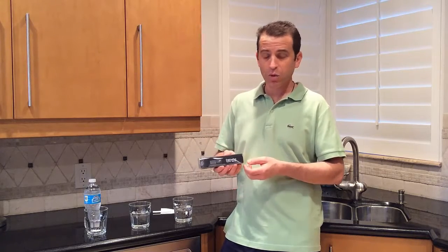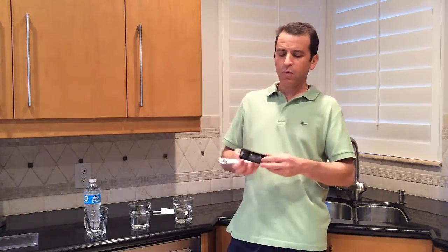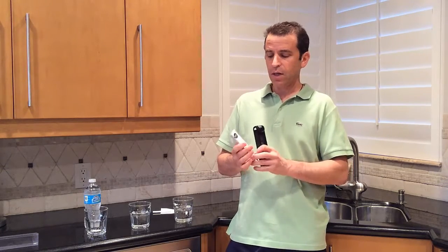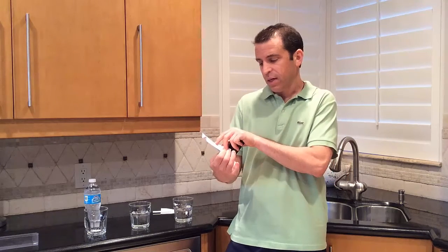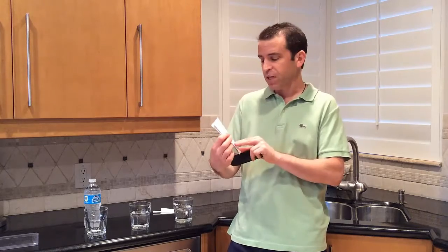This is the product you will receive. It comes in this plastic piece — let's take it out. Inside the packaging we've got the actual meter, which comes in a nice leather case. Within that comes information about the product: it talks about the hundred percent lifetime guarantee, operational instructions, best results, and instrument features. It does not only test how pure your water is but also has a readout for Celsius or Fahrenheit, whatever you might want.